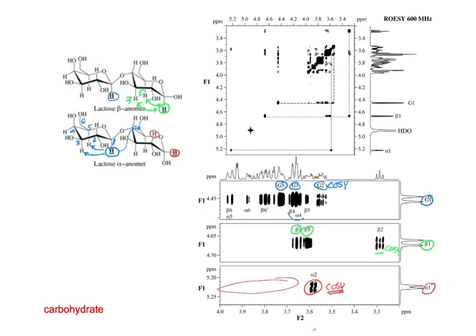All right, so this was just an example of applications of some of the techniques we've looked at to something that's a little more complicated. There are also some examples in the book, like a tripeptide. Where you have amino acids, and just like this, you have these isolated spin systems, right? That's a good place to use TOCSY, or maybe even this HMQC-TOCSY, so that you end up seeing the whole spin systems isolated from one another.